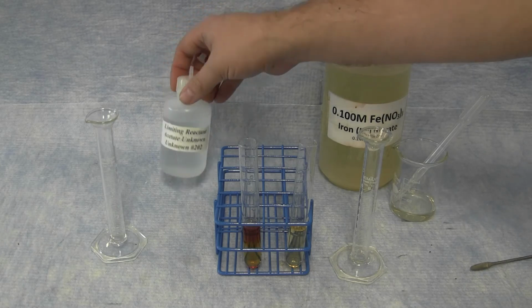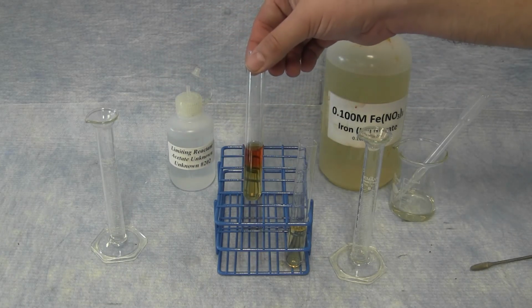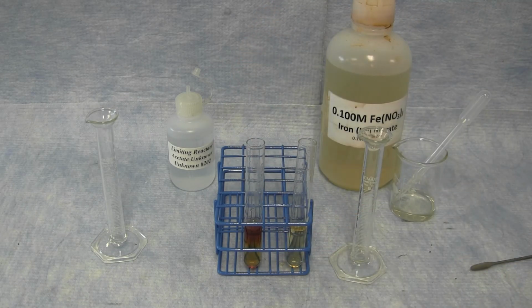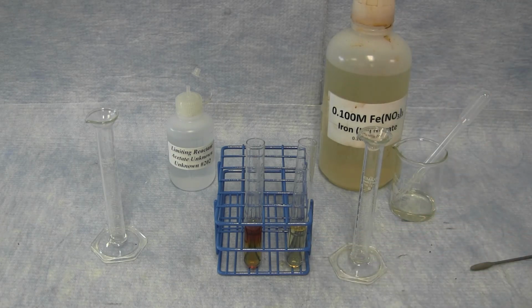By adding additional limiting reactant, the reaction can continue and the formation of the dark color will increase. When additional iron nitrate was added, the colored product did not appear, indicating it is not the limiting reactant.